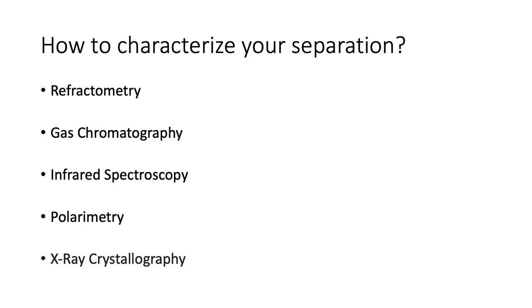So we'll be doing refractometry, gas chromatography, infrared spectroscopy, polarimetry, and X-ray crystallography. And so today we're going to talk about the first 4 of those. And then, like I said, in a week or 2, Peter Muller from the X-ray crystallography lab will come and do a much more detailed explanation of X-ray crystallography and what information you can get from that.